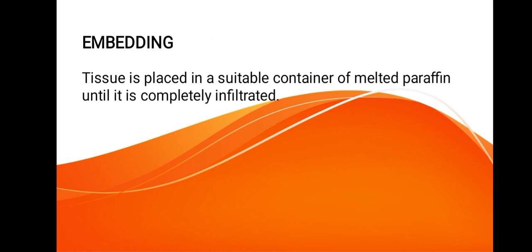That is embedding. You find that paraffin is not water soluble. Water is removed from the fixed tissue by passing it through successively stronger solutions of alcohol, that is now the dehydration part, till you come to embedding. We have machines for this, where these stages are conducted automatically. Like now we have an automatic tissue processor.